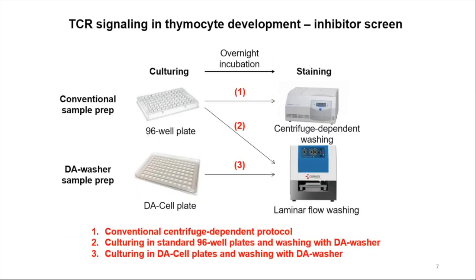Our assay involves the screening of kinase inhibitor libraries for their effects on the modulation of T cell activation markers, and this protocol would benefit from increased automation, and improvements in staining could help in the study of specific T cell subsets. For the assay, we stimulated mouse thymocytes with anti-CD3 CD28 coated beads overnight and measured the levels of caspase-3 activation and CD69 upregulation.